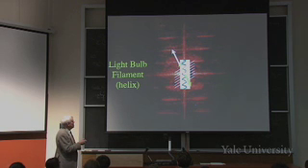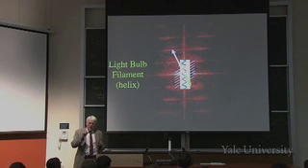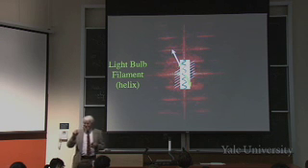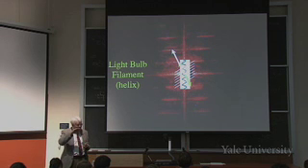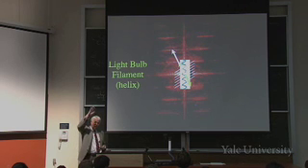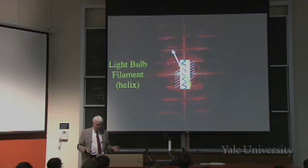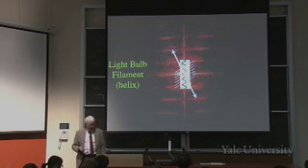But as the planes get closer and closer, the fact that the wire has a finite thickness means that some parts of the wire are out of phase compared to others. So because of the finite thickness, you expect it to slowly fall off in intensity as you go out. But you'll then get the third one along the branch and so on.